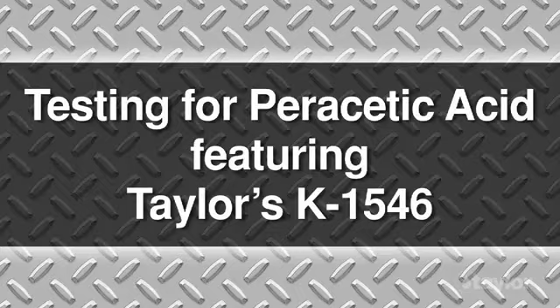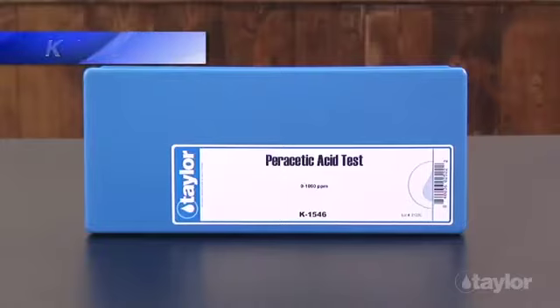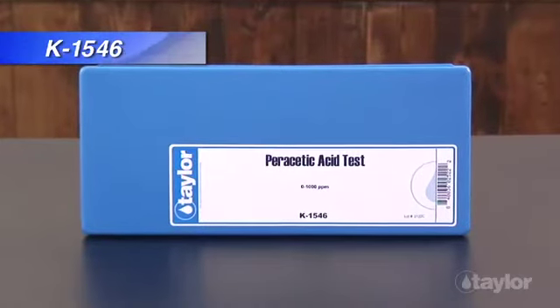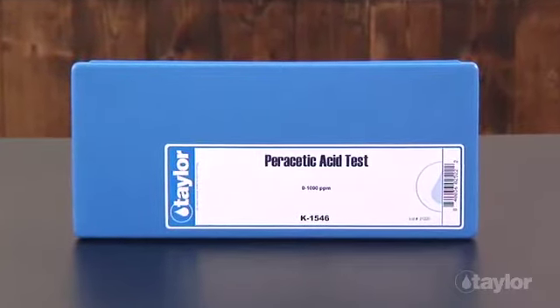Testing for peracetic acid, featuring Taylor's K-1546. Who should use this kit? Taylor's K-1546 contains a simple drop test for measuring peracetic acid, PAA.